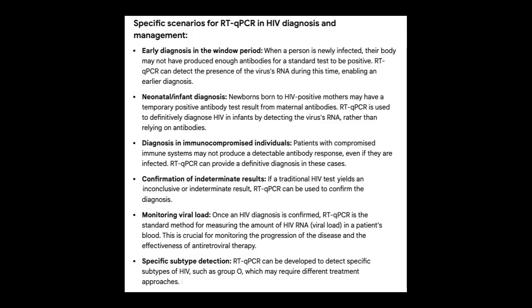And now we're going to come back to the present and look at one of the techniques that's used for a more precise HIV diagnosis. That technique is abbreviated RT-qPCR. And in this technique, viral RNA from a patient's blood sample is reverse transcribed into cDNA and is put into a specialized thermocycler so that the resulting cDNA can be quantified.